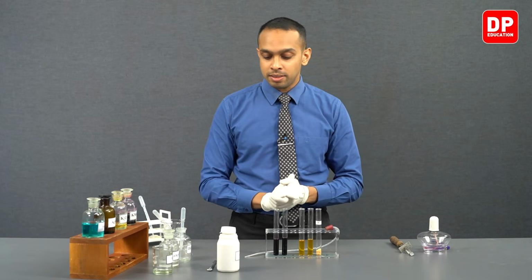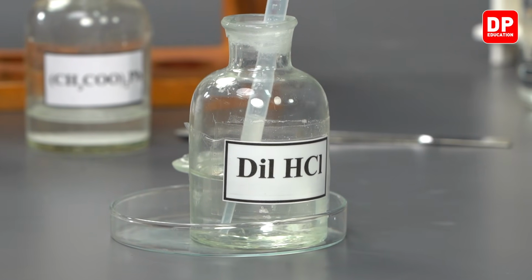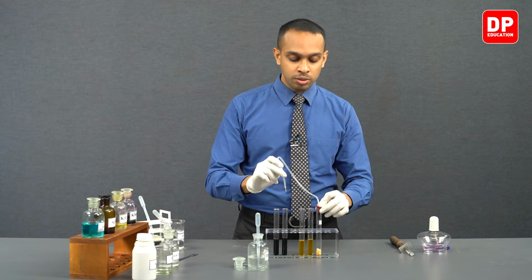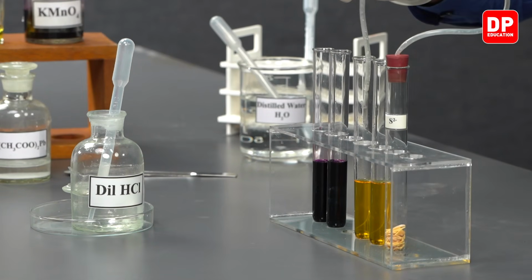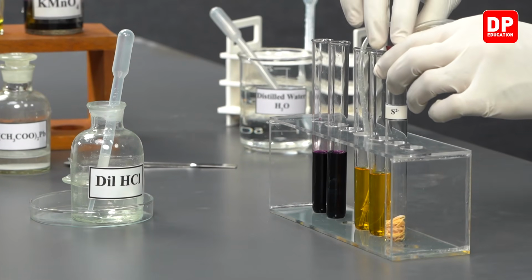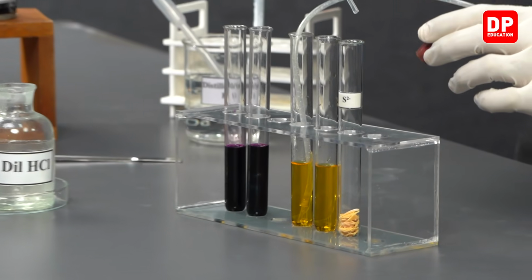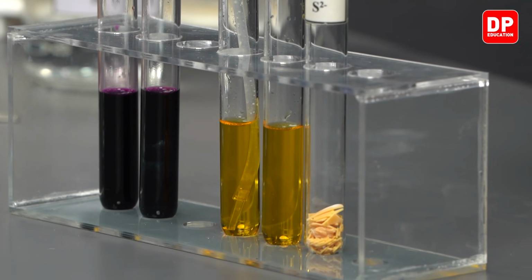and we are going to add hydrochloric acid to this test tube, and as soon as we add the hydrochloric acid, we will place the rubber stopper and direct all the hydrogen sulfide gas that is produced into this acidified potassium dichromate solution. So since we are going to start in that manner, we can insert this delivery tube inside our acidified potassium dichromate solution, and now we are going to add HCl to this sodium sulfide. So as soon as we add HCl, we will be placing the rubber stopper.